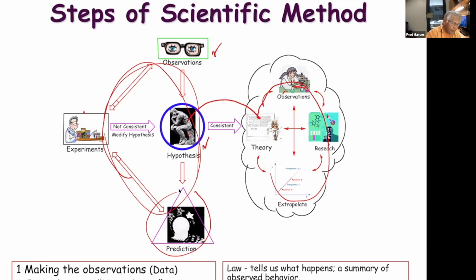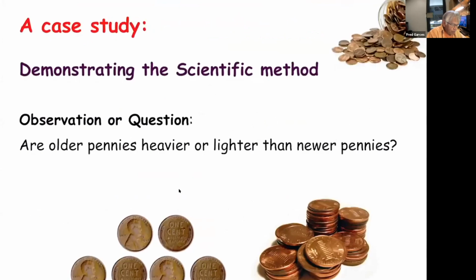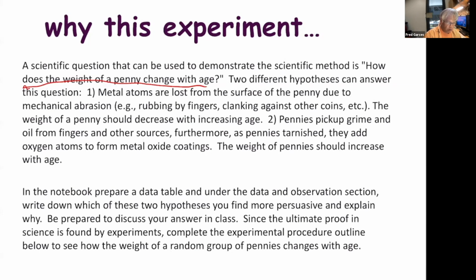Anyway, so this just tells you about the experiments. The question that we're going to ask is how, oops, sorry. How does the weight of the penny change with age? And you can take one of 2 stances. One is that it gets heavier, and you have to not just say it's heavier. You have to explain why it might be heavier. So that's the start of this experiment.